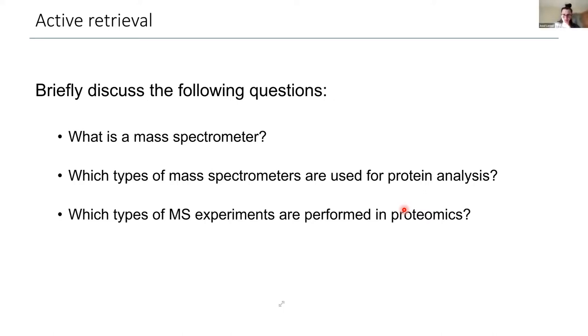You're not referring to top down or bottom up? No, even simpler. Do you mean targeted and untargeted? So one of them is you look at the mass of the intact peptide in this case, or you could think of the mass of the intact metabolite. But then there is something else you can do if you want to get more information about this specific molecule. It may be MS1 and MS2. Yes, perfect. Cool.